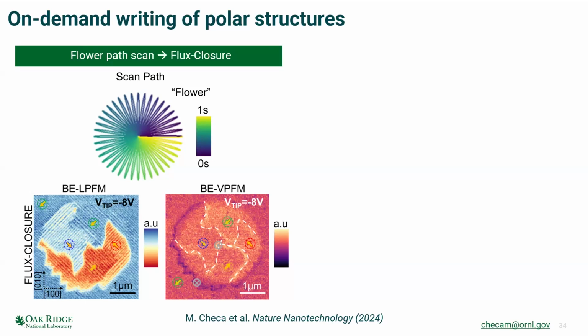Yeah. And this phase field modeling doesn't take into account that you can have carriers in the lattice, so obviously it will go up. We're working on it now for the switching mechanism, because when we try to actually put in the phase field modeling the tip going around, we don't see the nucleation of this type of domain.